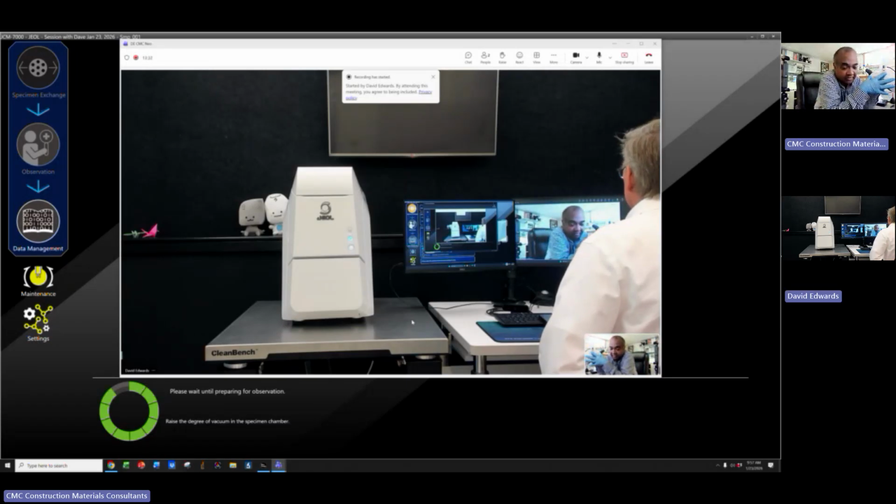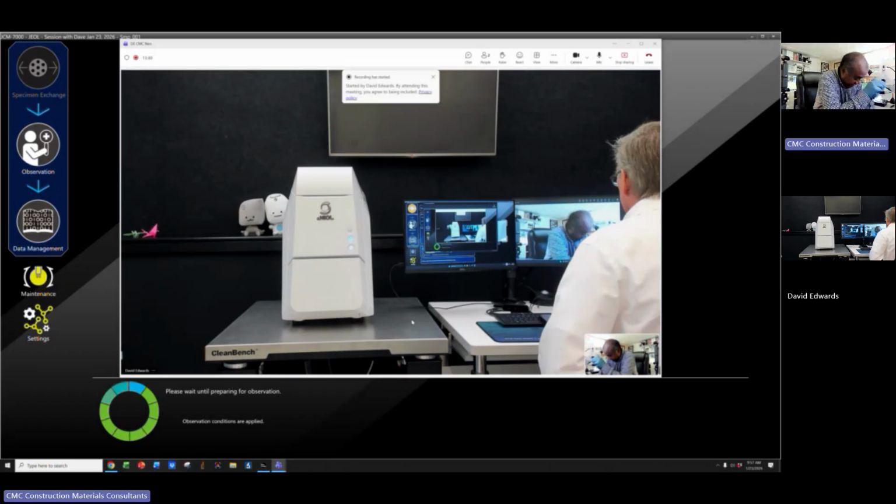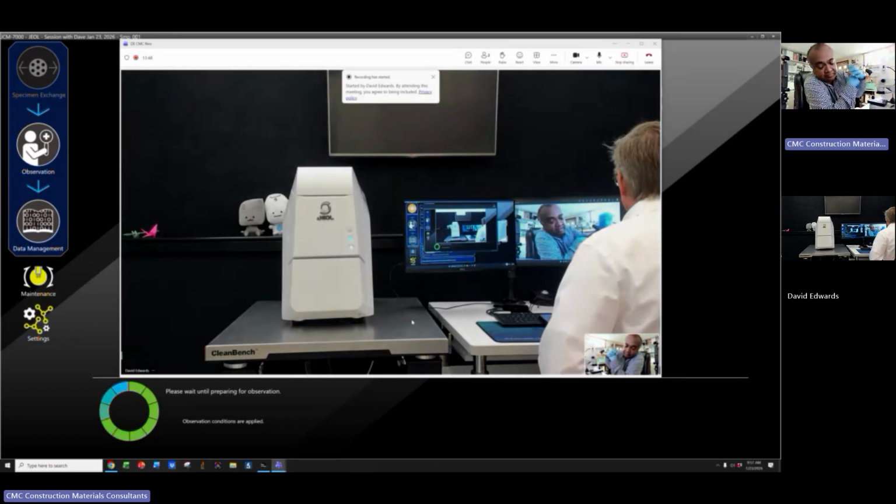But if I just idle the SEM for a week, live analysis doesn't show up. And when it does show up, my idea is wherever you click, you will get an analysis right there at the point of your cursor. But that's not what's happening. I'll show you next. Let me first.